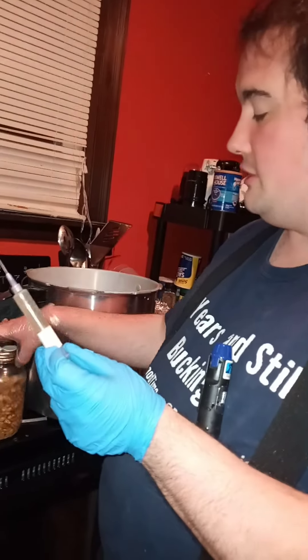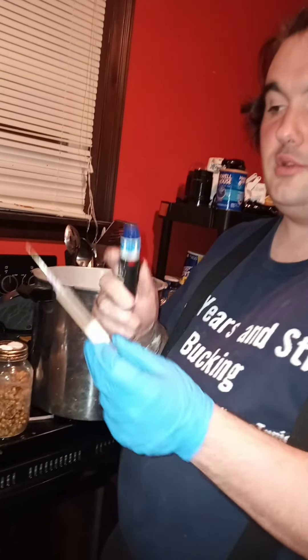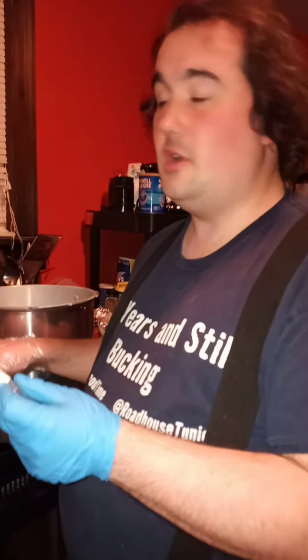What you do first is only flame sterilize your needle. Usually, if you're using a jar that hasn't been pressure cooked, you rub alcohol on the port — but not on the needle.